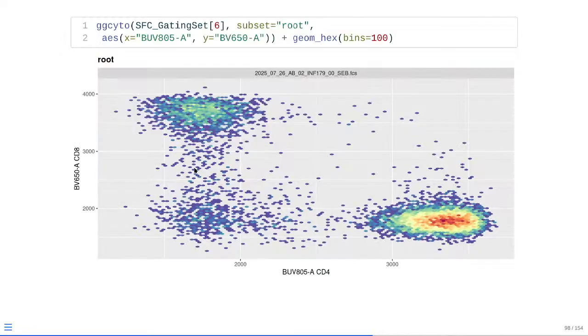As you can see, the plot has changed a little bit. There's a little bit extra spread on the negative population, but not very much. It's still actually resolvable, it's still discernible, so no major effect.